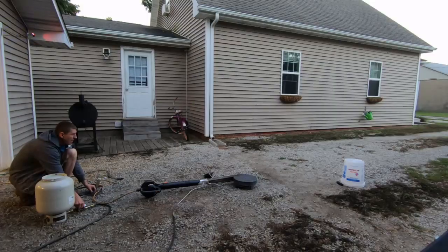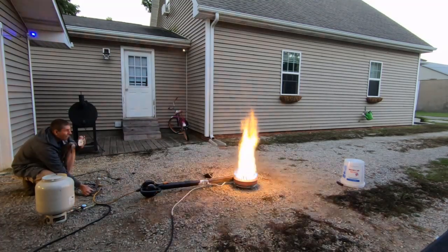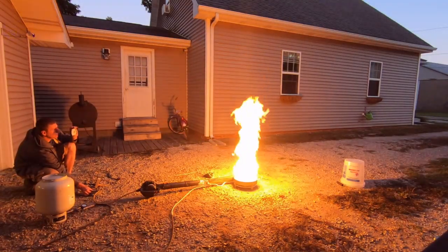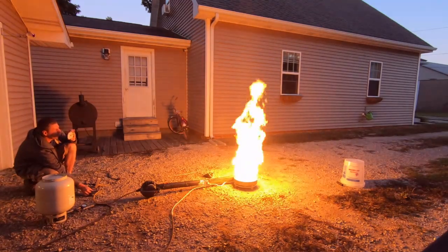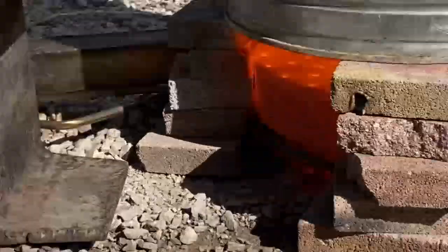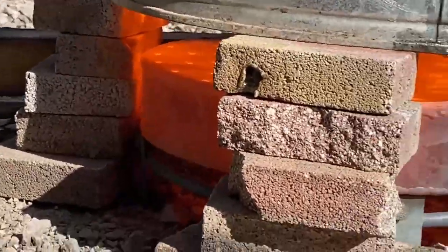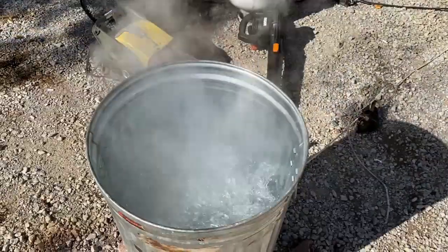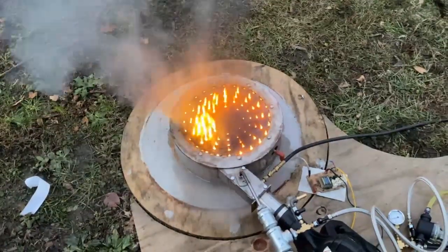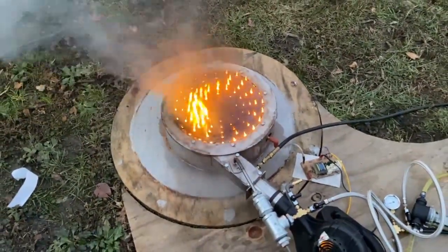The reason I'm using the banjo burner for the autoclave is because of the massive amount of power you can get out of one of these things. This little test here shows how much propane we're actually burning in a very small space — all I'm doing is throttling the air control, not touching the fuel at all. The thermal heat capacity of air is very limited, but the infrared radiation coming off that plate is huge. That is why I use this particular burner for the autoclave.